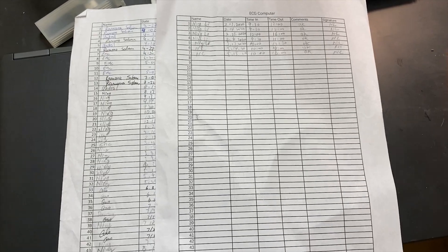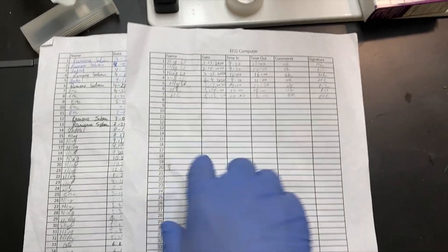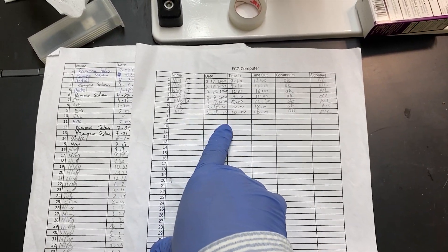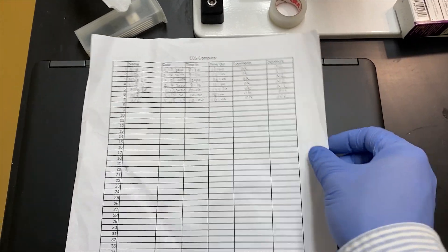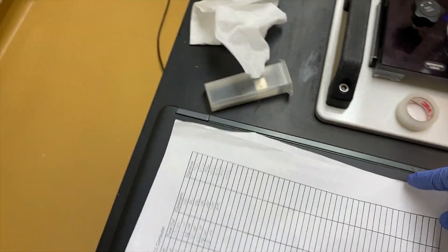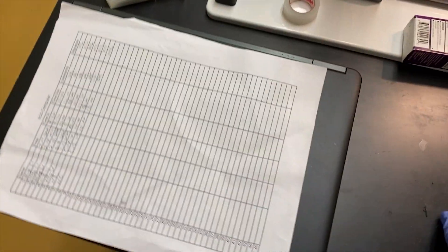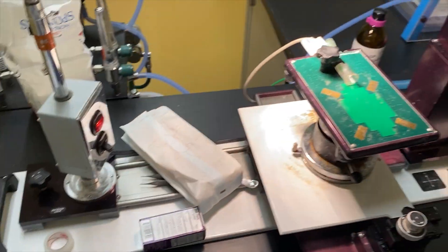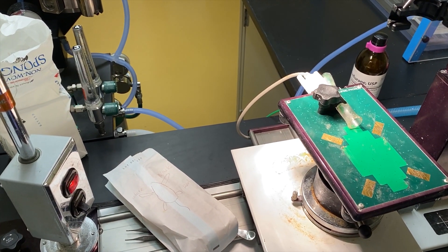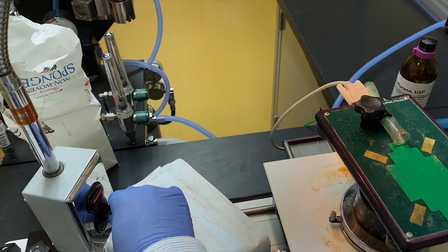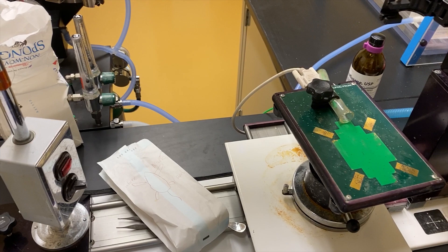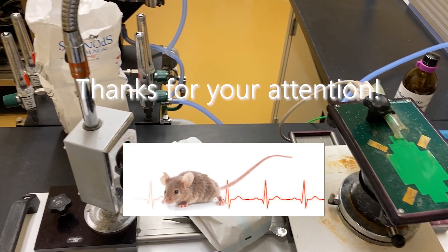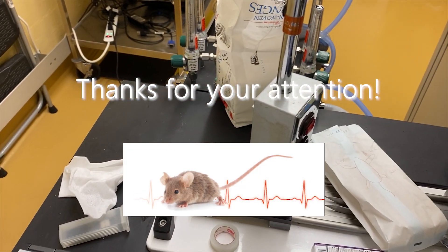Every time you finish, you must record your name and the date in the ECG computer. That's very, very important because you can find which day you did the mouse work. So be careful, every time when you have the experiment, the recording is very, very important.